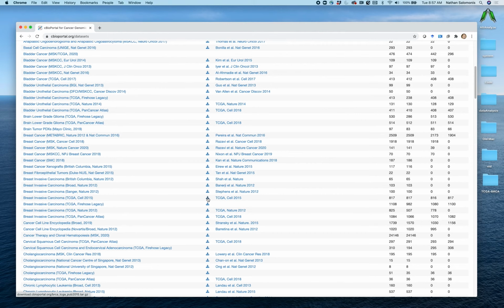It will extract it. And within there is an RNA-Seq expression file. We're going to use the non-z-score normalized file because the z-score normalized file has NAs in it, which we'd have to replace with some other values.